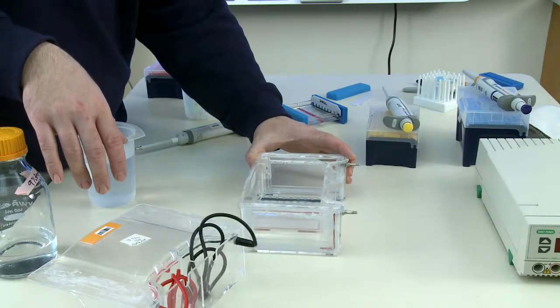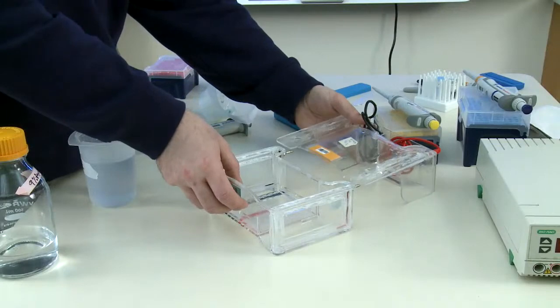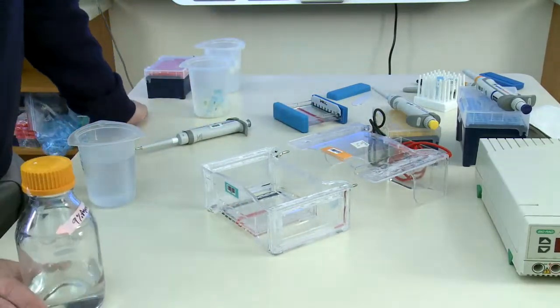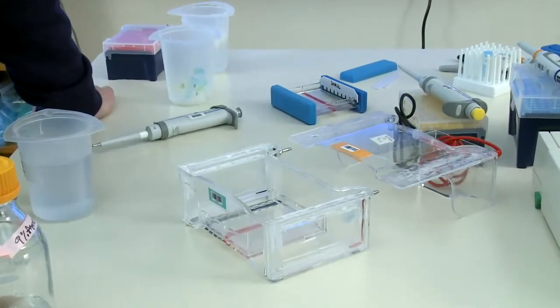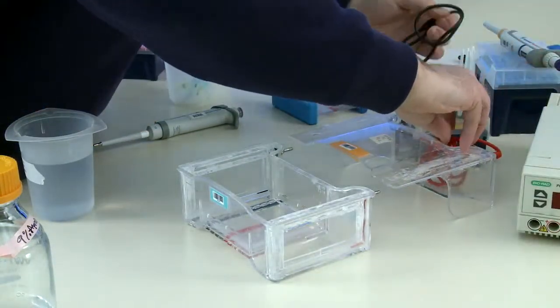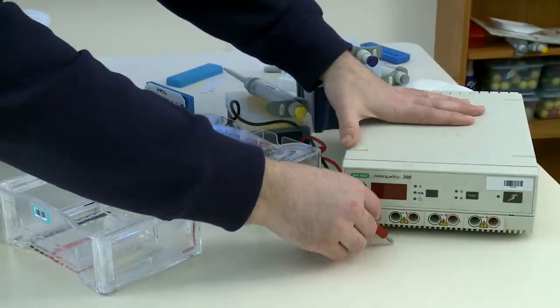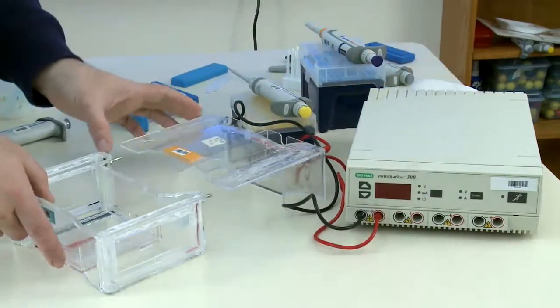I'm going to basically put it right there in the middle of the gel chamber. And so now I can essentially prepare to hook it up to our power supply here. So the power supply has a bunch of little ports in it, and you'll notice that there's a black and a red wire. We're going to match up black to black and red to red on one of these ports here and plug it in just to get ready.